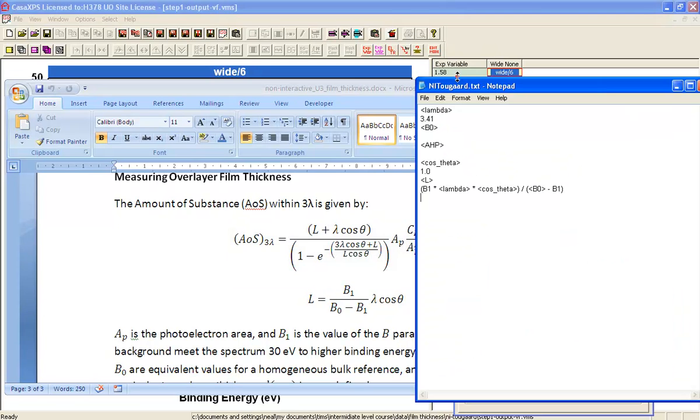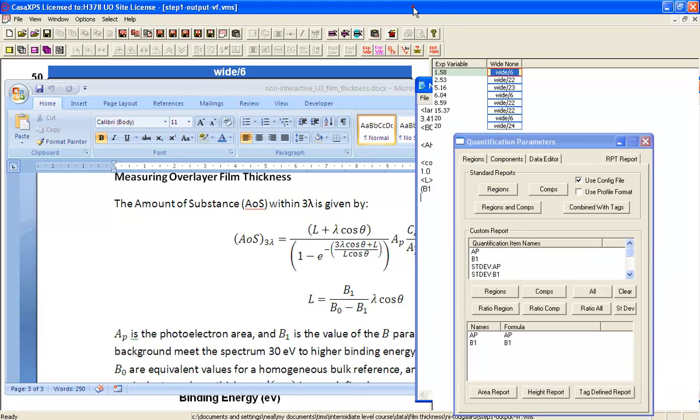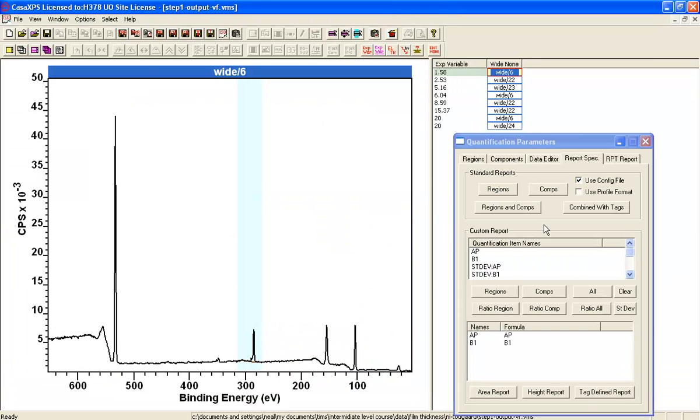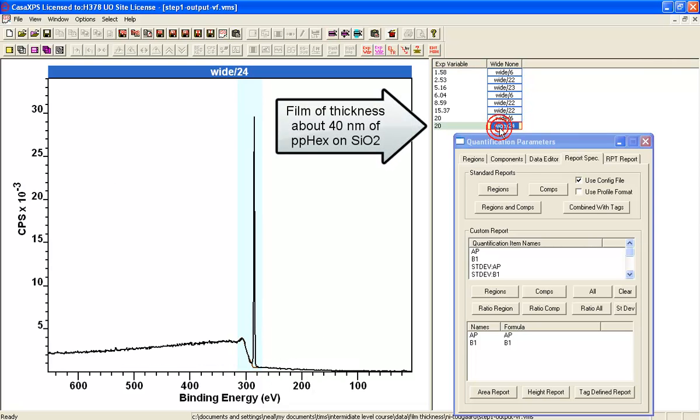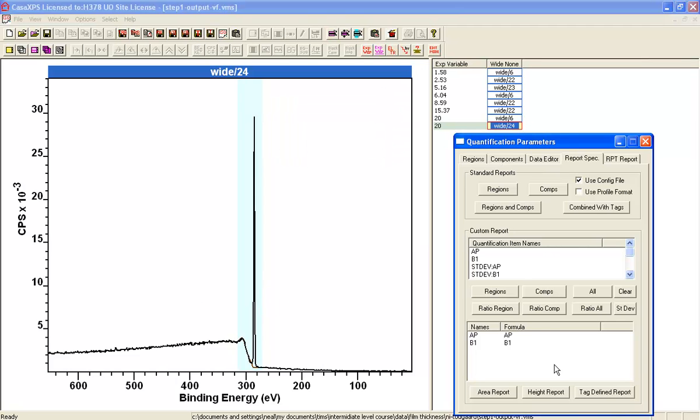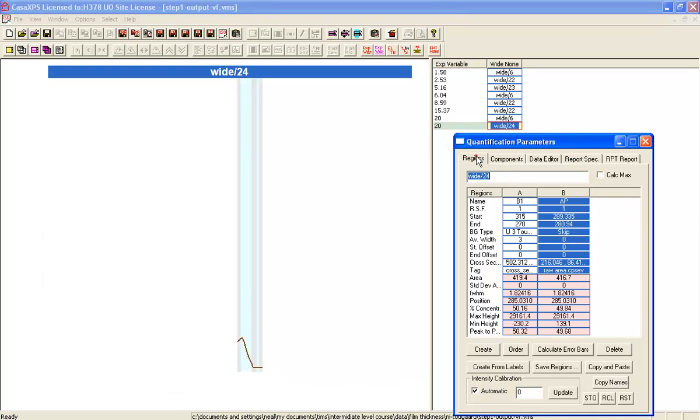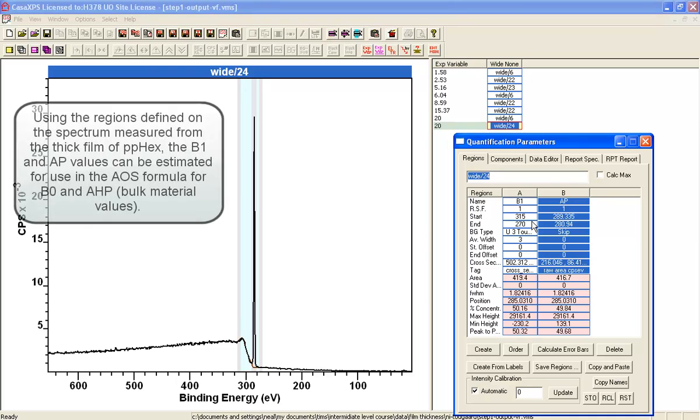So let's now actually work out what these values for B0 and AHP might be from the data that we've got. That looks like the thickest film. So what we'll do is we will use the values that are being calculated for B1 and AP from this thickest film to represent our thick layer of PP hex.